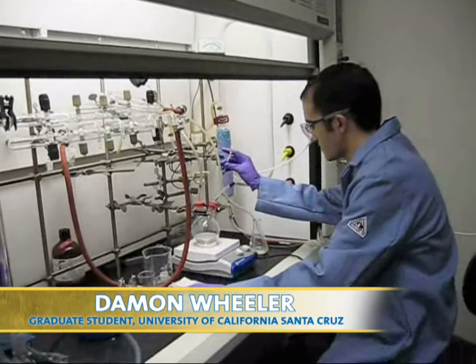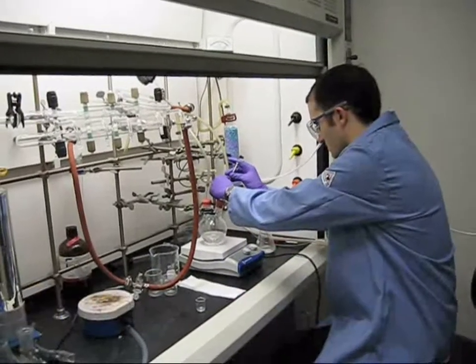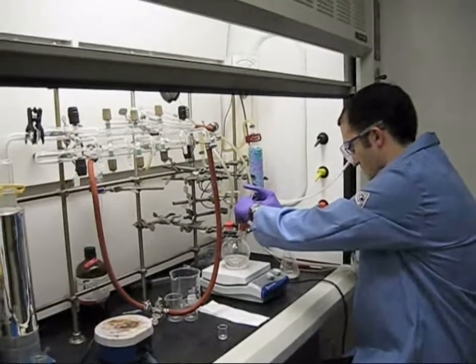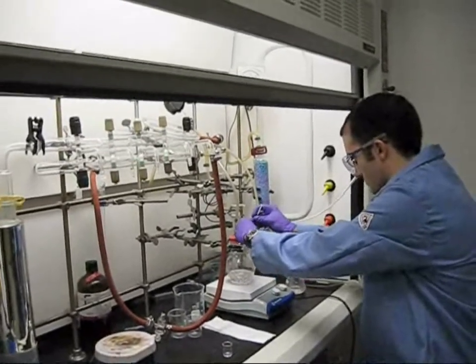Damon is beginning to make hollow gold nanoshells. To do this, he's going to use sodium borohydride to reduce cobalt two plus ions to cobalt zero nanoparticles. Watch as the solution turns dark brown in a few seconds.